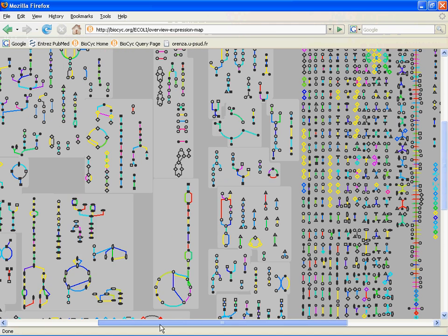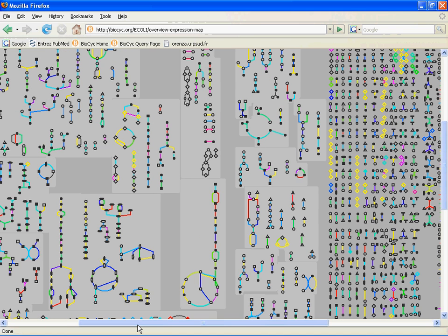So I'll move over here, and you can see this ends up being a more colorful display because we've included a lot more of the bright outside colors by setting these cutoffs. Basically, this is one way to, at a glance, get things above and below a certain cutoff while still seeing what the gradations are in the middle. So that's one way to do it. And this is one way that you can set your data sets to be all comparable with each other.